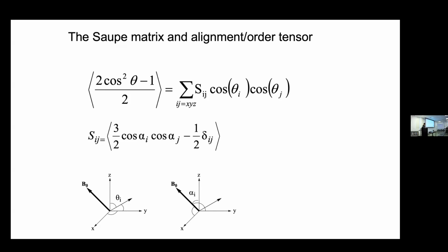And the way to ensure that is the case, of course, is how would you make sure the ordering medium is not affecting your sample? How would you do it? What if your ordering medium is interacting with your sample? That would be problematic. I mean, that could be of interest. How would you make sure it's not? So you compare the spectra, and you discover there are some changes.